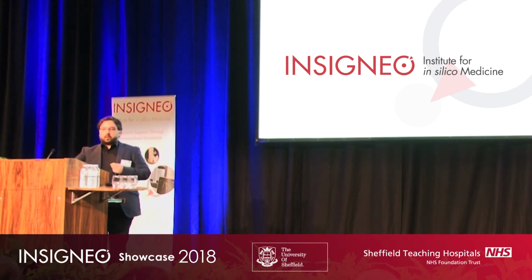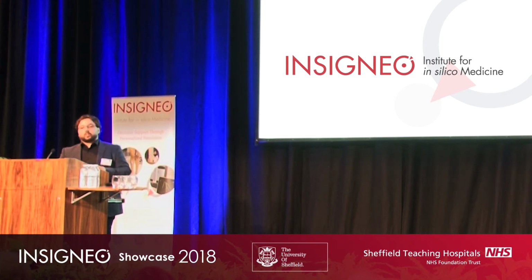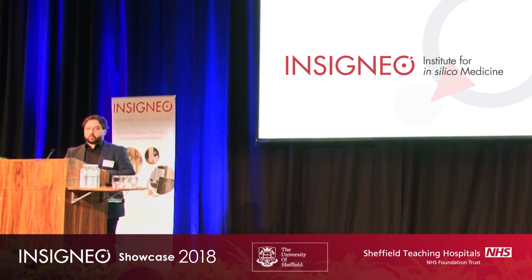So to conclude, I hope that I showed you how we can use the digital volume correlation approach to investigate and measure heterogeneous deformations in very complex materials, even for small deformations. In any case, we need to accept a compromise between the spatial resolution of the measurement, so how detailed the displacement field measured by the DVC is, and the final precision of the method. So again, we need to find a compromise there. And this can also be used for validating the output of micro-finite element models.